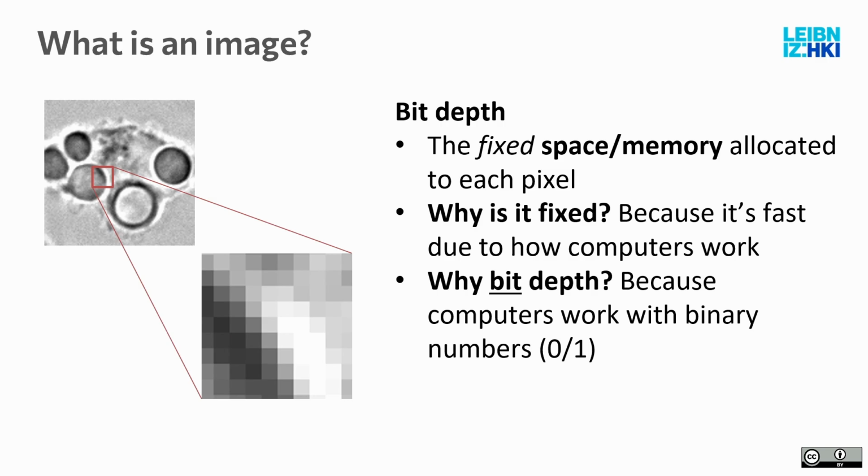And then there's its related concept. It's the so-called bit depth. As mentioned, nothing here is infinite. Each pixel has only that much storage, and so it needs some space to store the information, and this can only be finite.